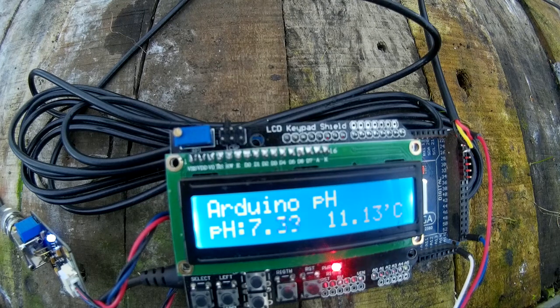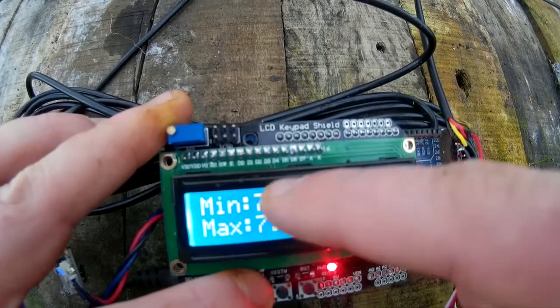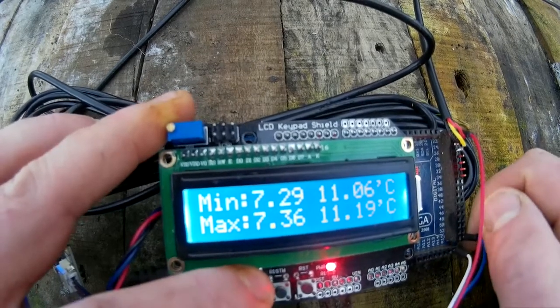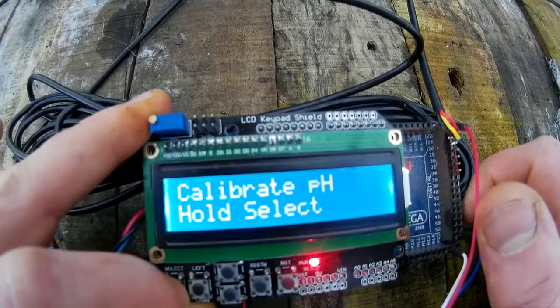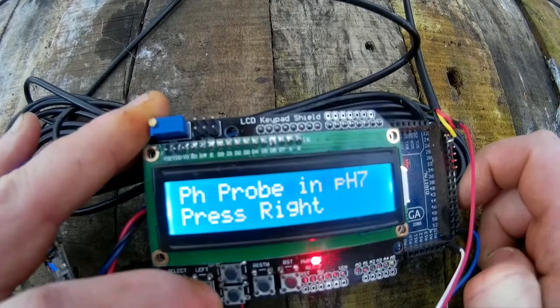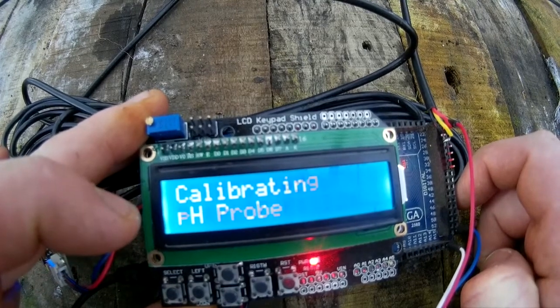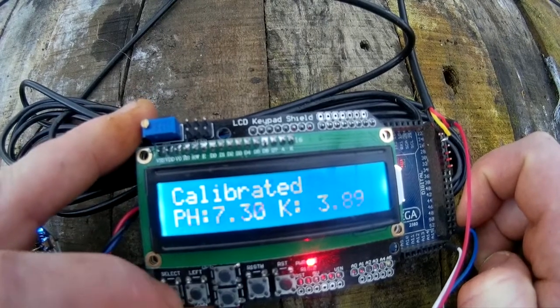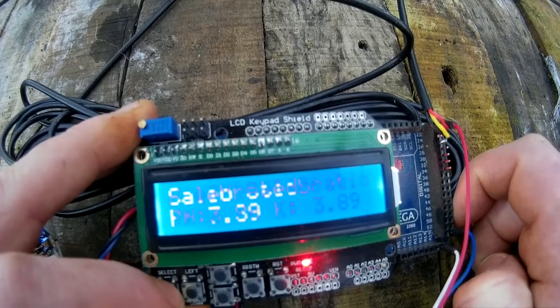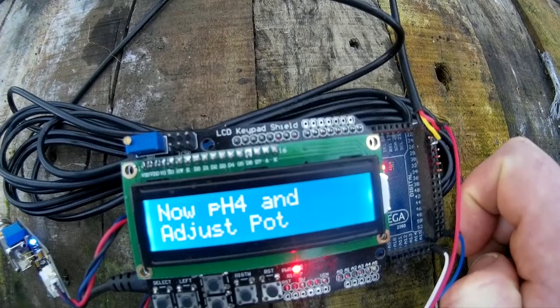We're in pH buffer 7 and this is saying we're at 7.3, so obviously we need to calibrate it. Press up — you'll see min and max values, uptime counter, and then calibrate pH. Hold select. It asks: is the pH in pH 7? Press right, then select to save. It reads 3.89, and then it will tell you to adjust for pH 4.